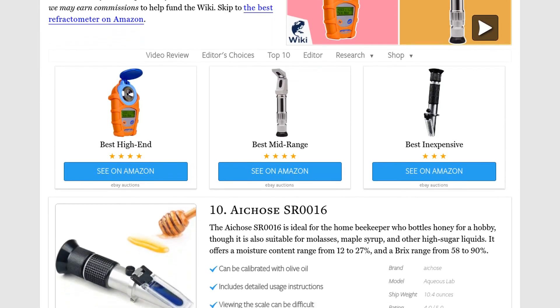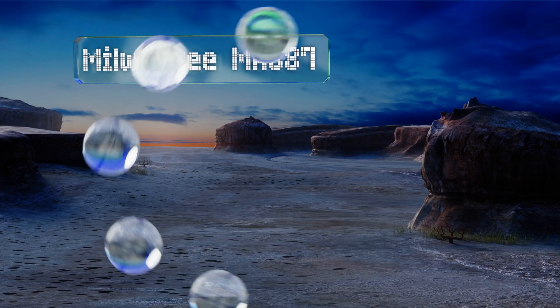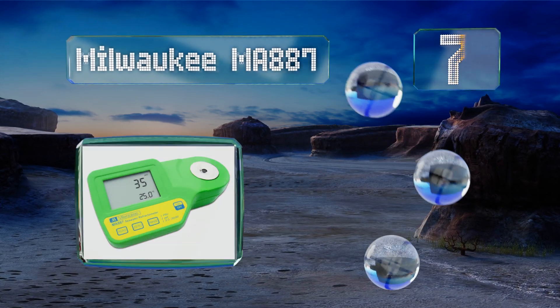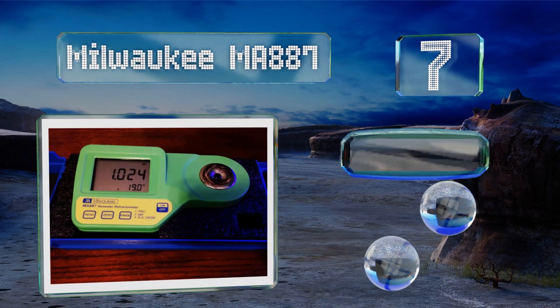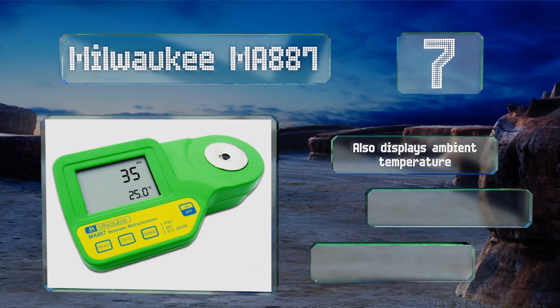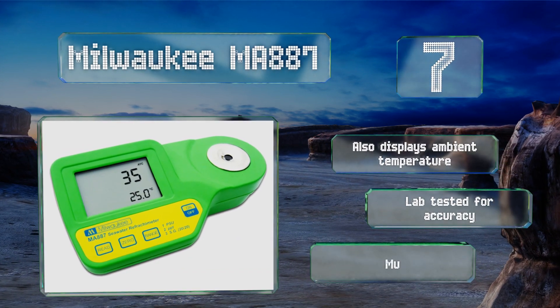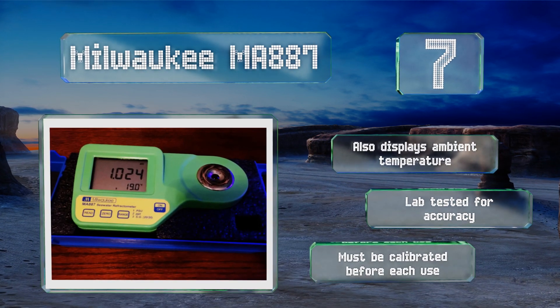At number 7, the Milwaukee MA-887 takes the guesswork out of determining the salt level of water. It only requires a couple of seconds to produce results and provides them in practical salinity units, parts per thousand, and specific gravity. It also displays the ambient temperature and is lab-tested for accuracy, but it must be calibrated before each use.